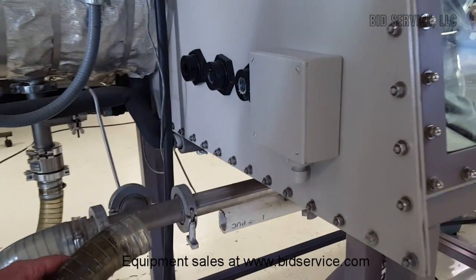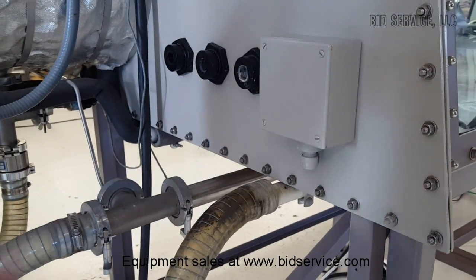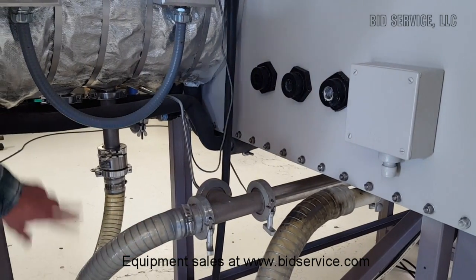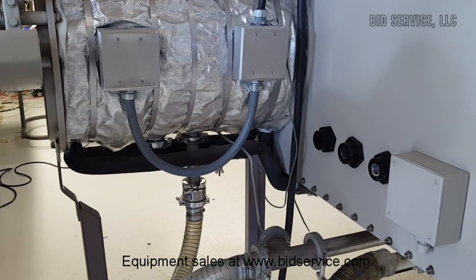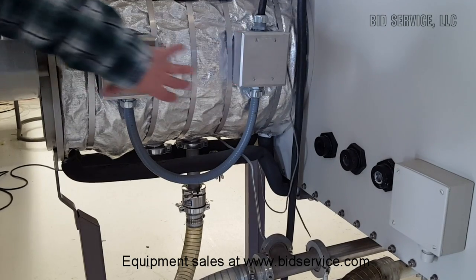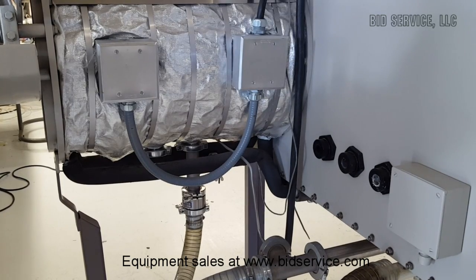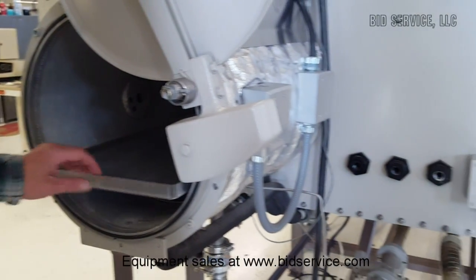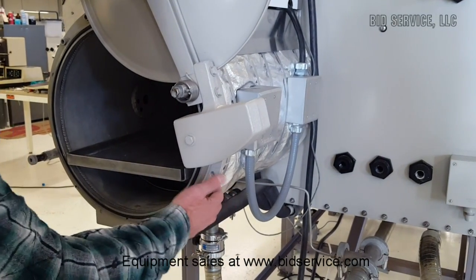Here's our PVC pipe — that's the exhaust port. I just have it hooked up to our house exhaust system going outside. On this side we have our vacuum line coming in: the small line is for the mini antechamber, and the larger line is for the heated vacuum oven antechamber on this side. These are the heaters wrapped around the outside of the chamber — that's how you heat this antechamber. There's also a shelf on this side that will slide out when the inner door is open, and we have cooling lines here.